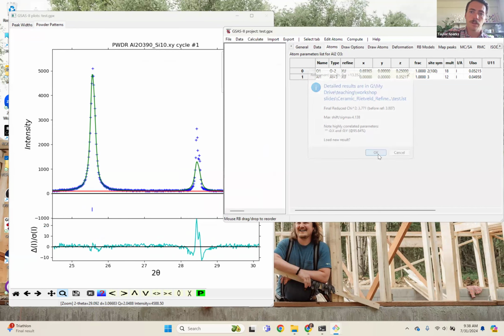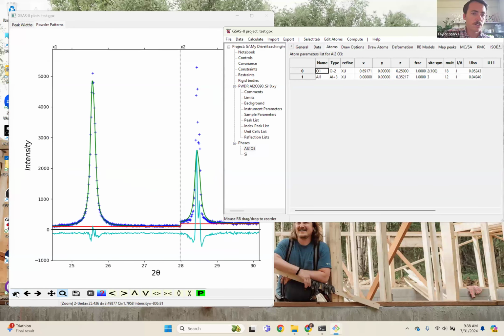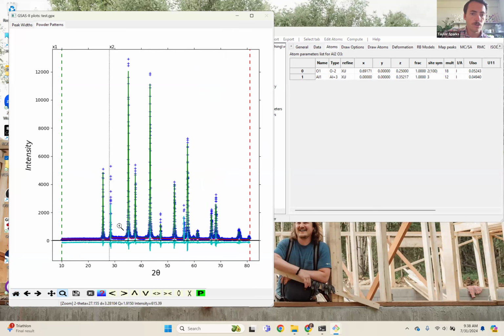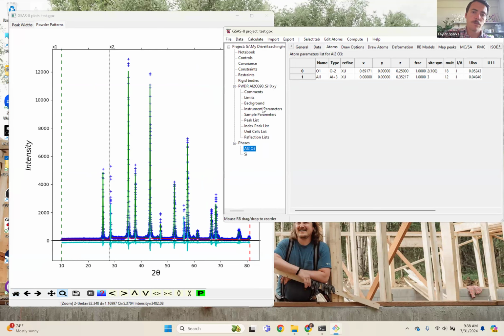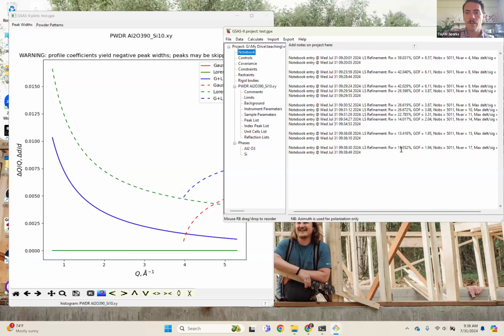Yeah, it's not a big improvement. I think it dropped down to 13.3. But we're getting close to about as good as we can do on this one because, again, with refinement software, you just keep on clicking boxes and it will just happily keep on changing things. But at some point, you're changing stuff that isn't physical and isn't meaningful. And we're already getting pretty close to what would be an acceptable value anyways.